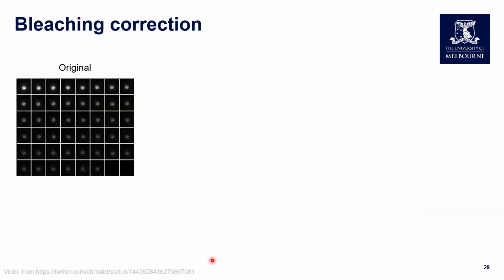And in fluorescence imaging, especially when you do some live cell imaging, your sample fluorescence signal may bleach over time, or sometimes when the fluorescence lamps start to play up, it may jitter over time or within your 3D stack. This is an example where the image was taken over time and shown as a montage. You can see the intensity of the sample bleaches over time, and this bleaching makes image analysis very difficult.